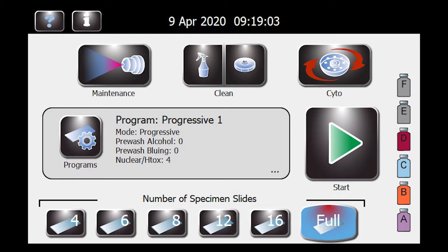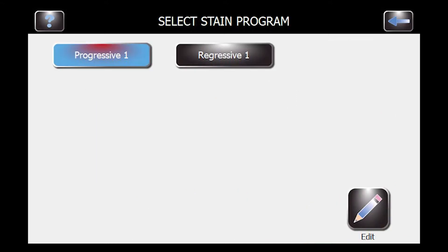The machine will come with two programs on it — go ahead and click the program button. The progressive one and the regressive one will be on the machine when you get it. They're good programs to start with that we've used in external and internal validation.